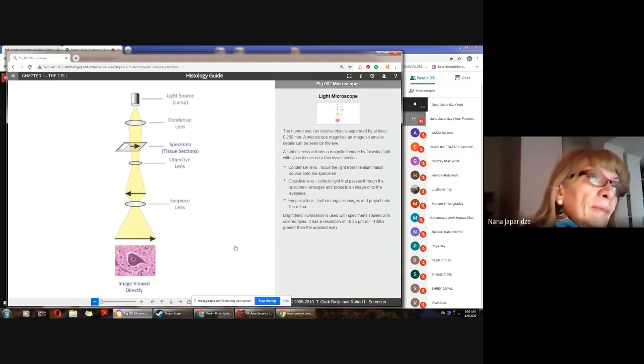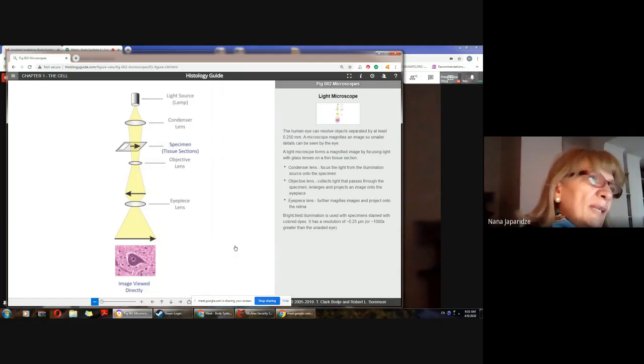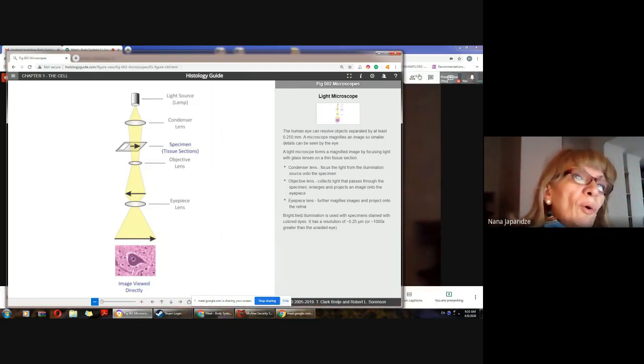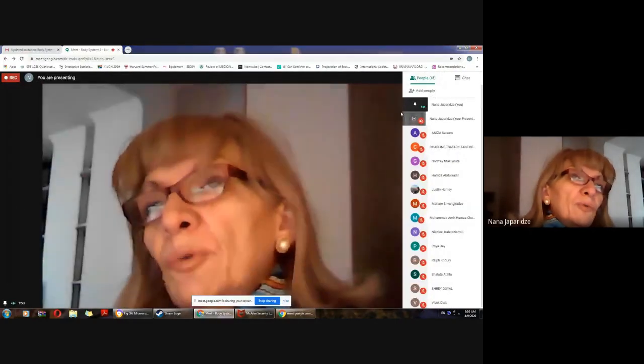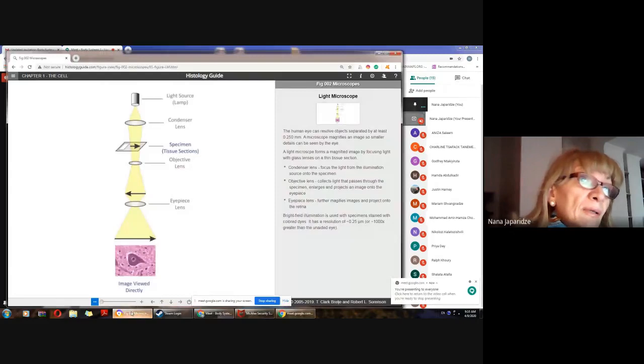Then, besides fixation, very important is dehydration. Using dehydration, we remove from the whole tissue sample the fluids, any kinds of fluids.